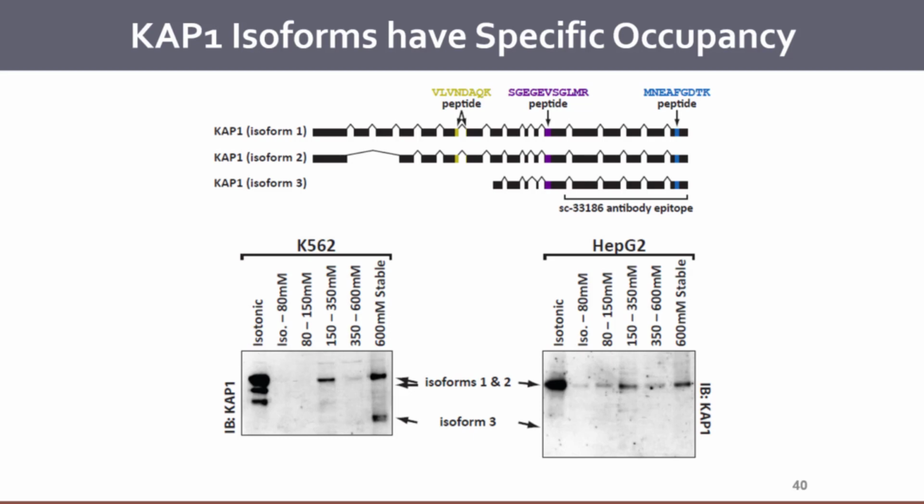In fact, one of the earliest cases we did, one of the first targeted assays we made was to a protein called surfactant protein B. It's a roughly 500 amino acid gene that gives rise to a functional protein of 79 amino acids. The postdoc that built the assay to start with just made peptides to measure the whole 539. And then we made these measurements, and the peptides that were coming back the most were actually ones on the carboxy terminus. And the scientists that we gave the data back to said, it can't be right. You're measuring these peptides in the carboxy terminus, it's not the functional form. It turns out our data was right.